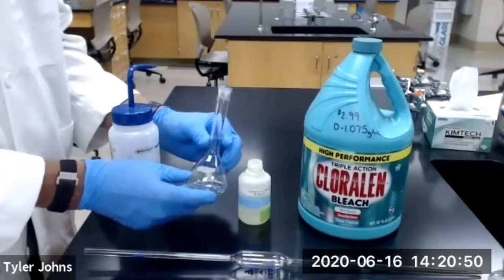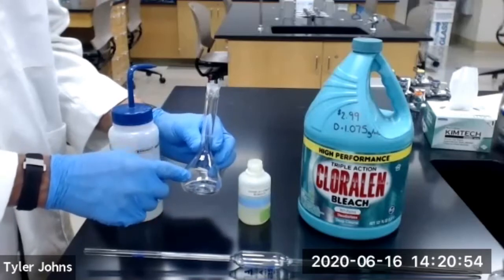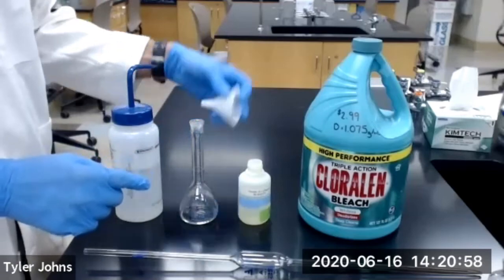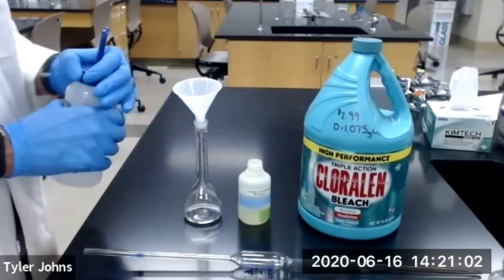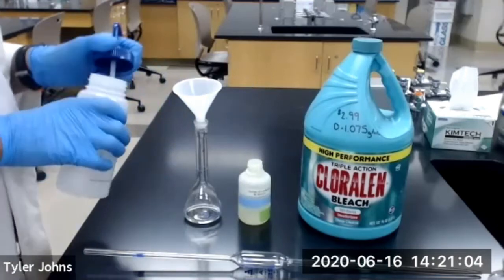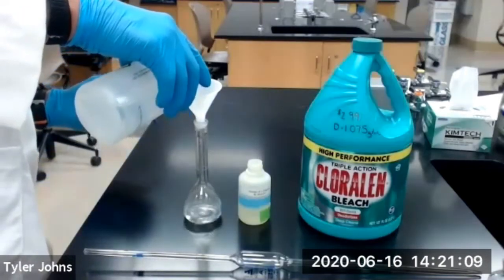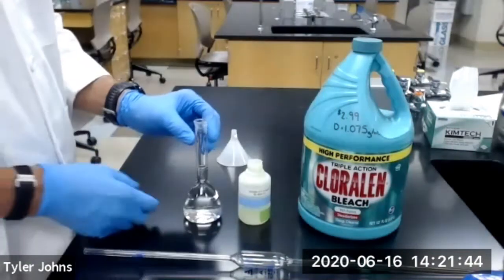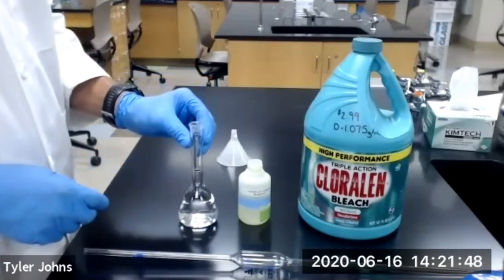We'll then dilute our commercial bleaching solution that we just added to our 100 milliliter volumetric flask with deionized water. So we've diluted our commercial bleaching solution with deionized water.